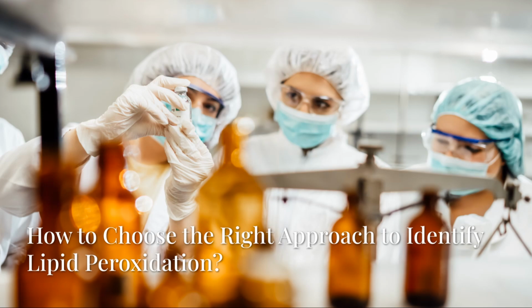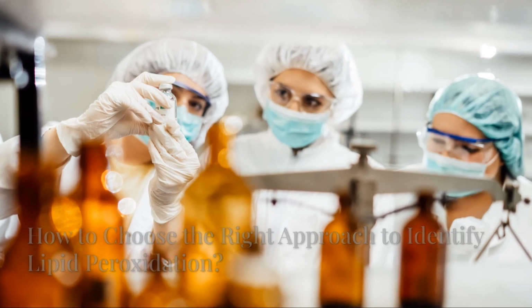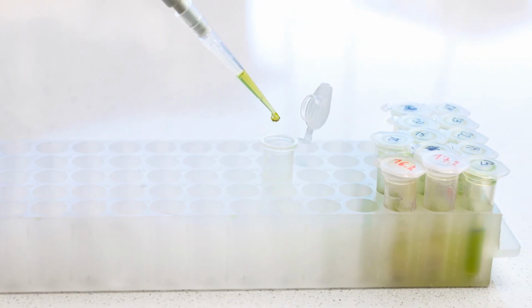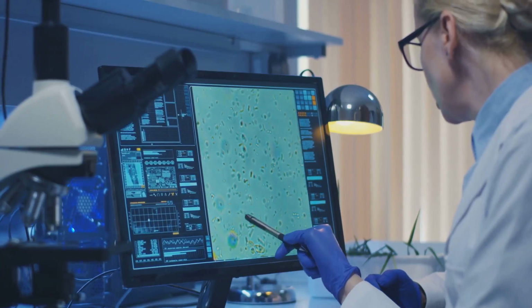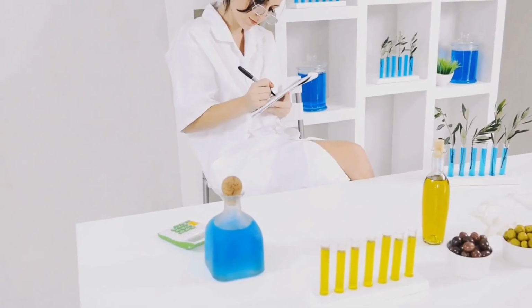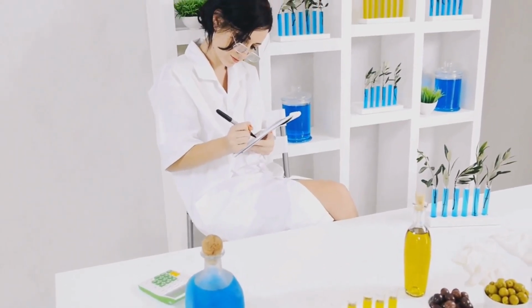How to choose the right approach to identify lipid peroxidation. If you need fast screening, use assay-based aldehyde detection. If you need depth and specificity, use lipidomics. Matching your research goal to the right method makes identifying lipid peroxidation simple instead of overwhelming.